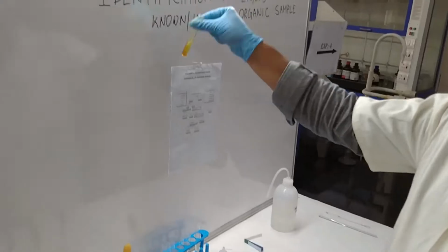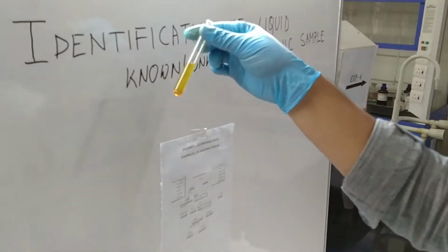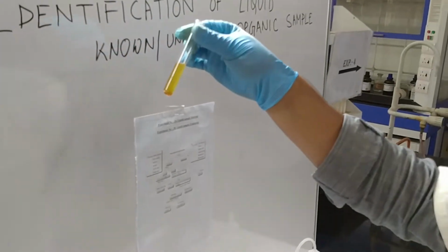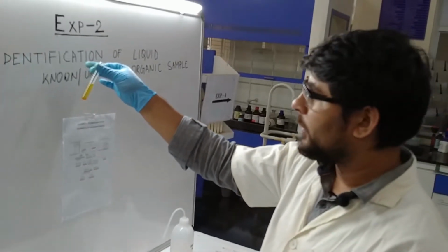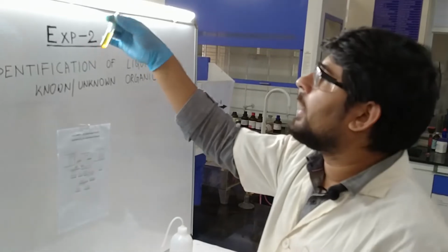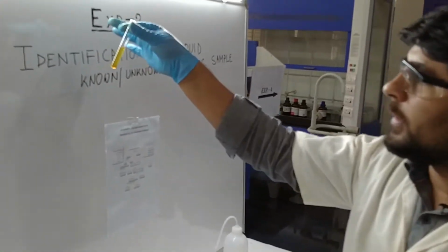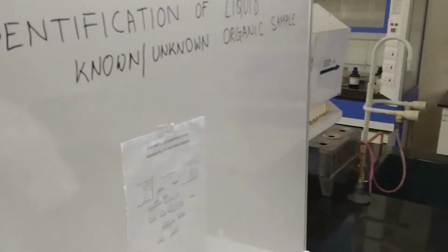So as we added iodine solution, it turns into this color, and this is not like the previous one. Actually, the positive observation is what? A faint yellow coloration with a PPT should appear. So only the color changes and nothing is present inside the test tube, and you can consider this one as a negative observation.